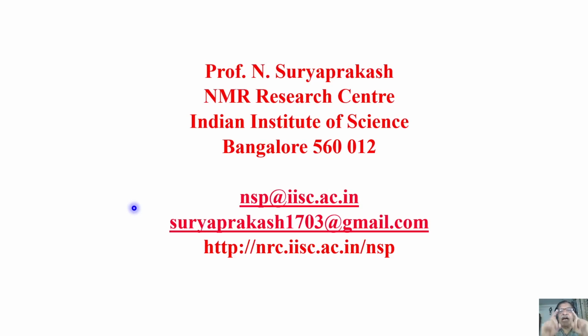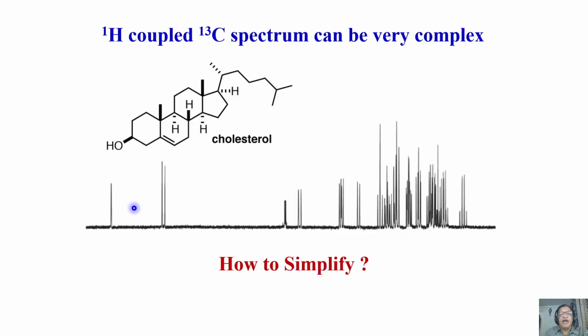That's what I said. Carbon 13 spectrum is the superposition of the spectrum corresponding to each isotopomer. On the other hand, in the proton, I said it is a spectrum of a single molecule. But the carbon 13 spectrum is not from a single molecule. It is a superposition of the spectra of n different isotopomers. Okay. And finally, we came to the situation we saw.